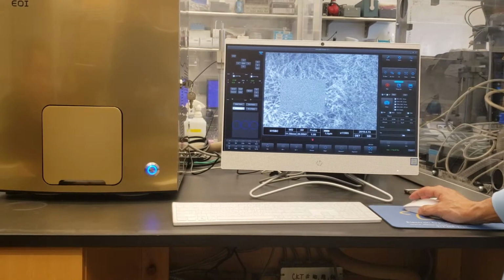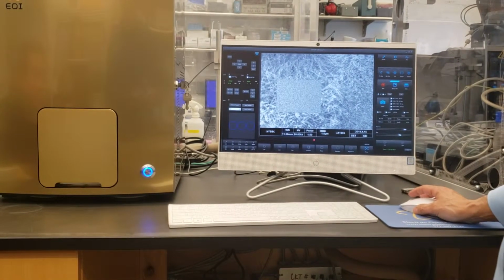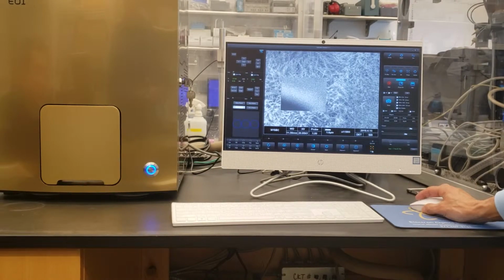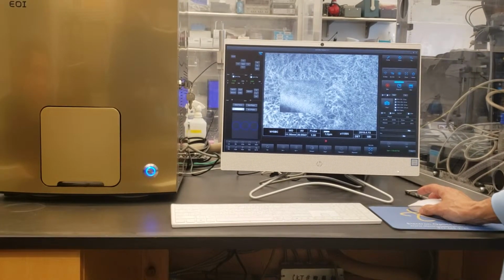So what I like using is I'll use the fine focus initially. I mean, we're at a high magnification as well. So 11,000x, trying to focus sometimes is a little difficult. So I'll just lower the mag a little bit just to see a shade, and I'll come back in here again, click on my slider, and I went the wrong way. So there we go.